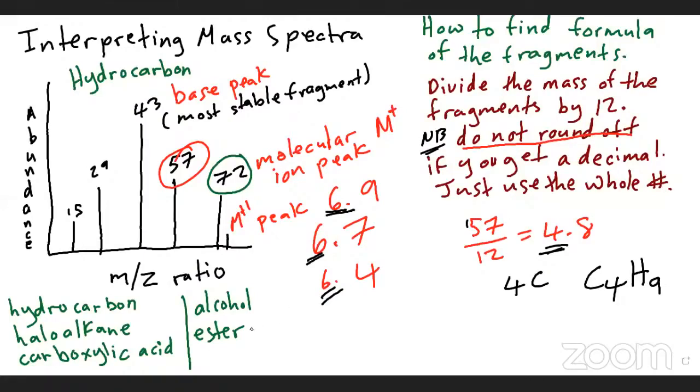All right, let me show you now. So we know that the molecule is pentane. Pentane has 5 carbons. So I'm going to draw the molecule of pentane down here. So 5 carbon, 12 hydrogens.